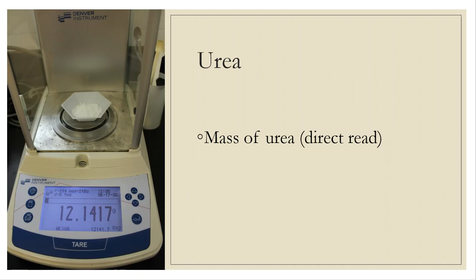So 12.1417 grams of urea is what we use in this lab.